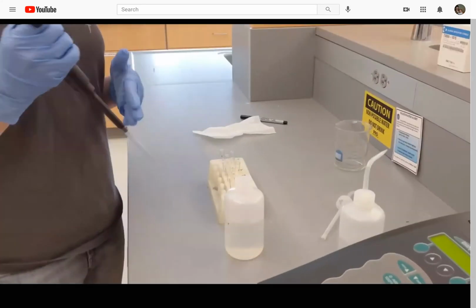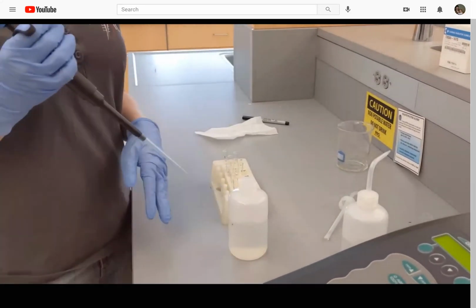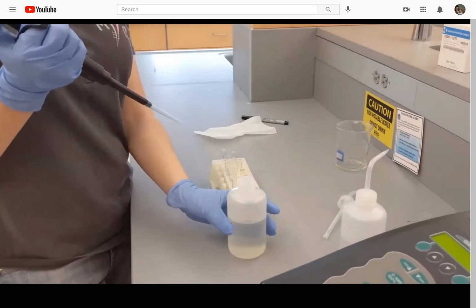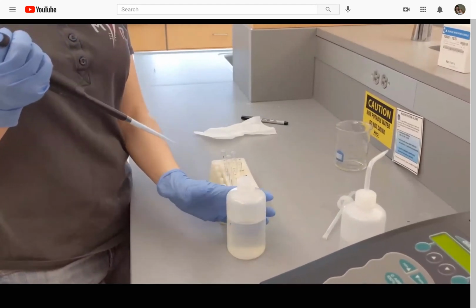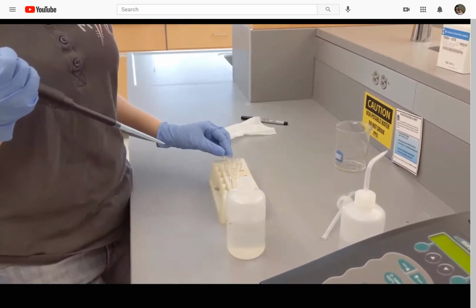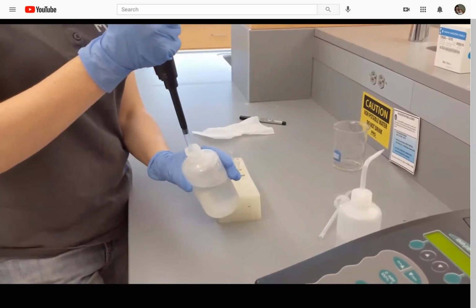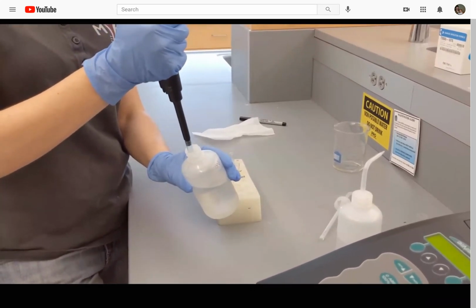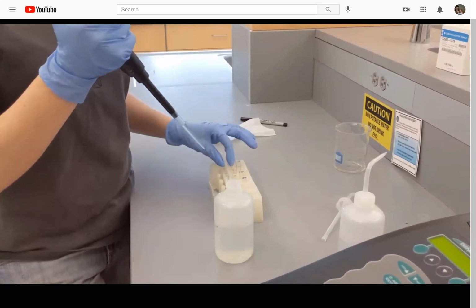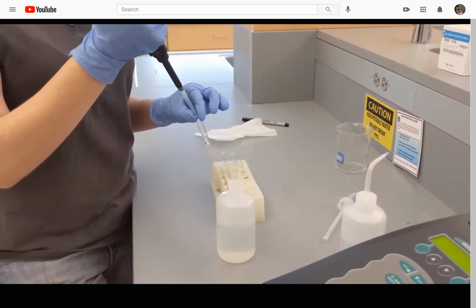All right, I'm now going to make our dilutions. We're going to have a set of 9 dilutions. I'm going to start with the DI water. So I'm adding 1,500 microliters to each of my test tubes here, except for my standard. So I'm going to add the water first. And 1,500 microliters is the same as 1.5 milliliters.